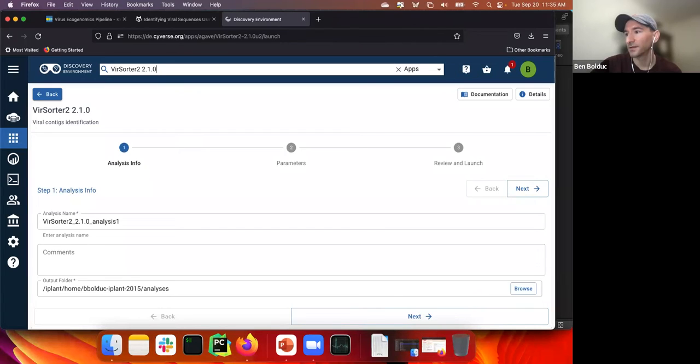So that was good. What software can create assembly graphs from assemblies? The assembly graphs are generally generated by the assemblers themselves. I am not aware of any tools. I know there has to be a tool that exists though, that will generate the assembly graph from some intermediate file of the assembler. I don't know. I think SPAdes is really the big name that generates the assembly graph.